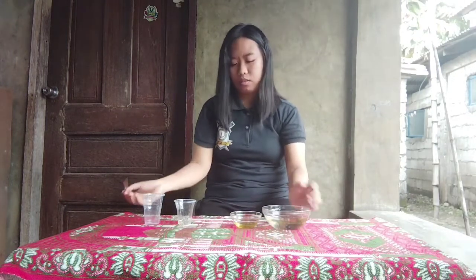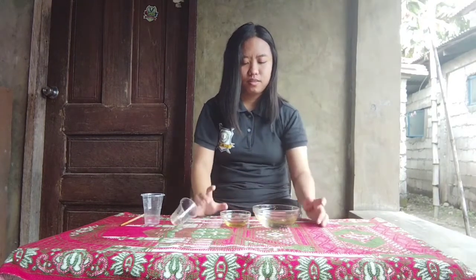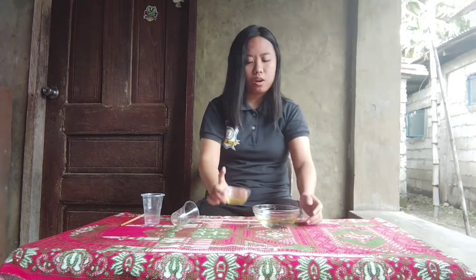And now this is the oil and this is the water. And that's how we separate oil from water by decantation.